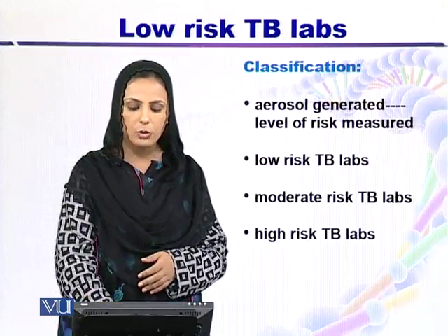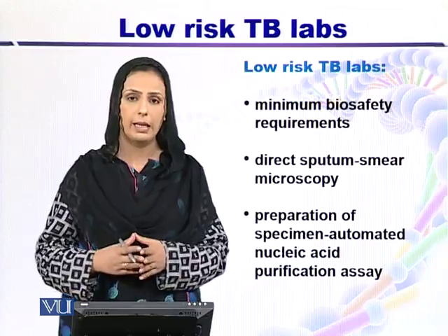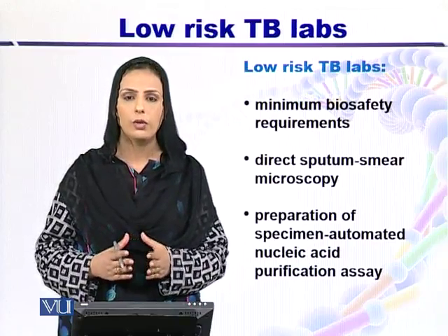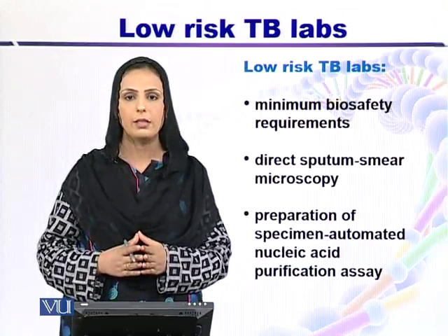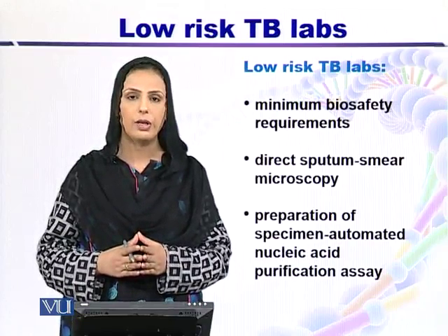So now let's talk about the low risk TB labs. It is called low risk because there are minimum biosafety requirements which are needed in the low risk TB labs.